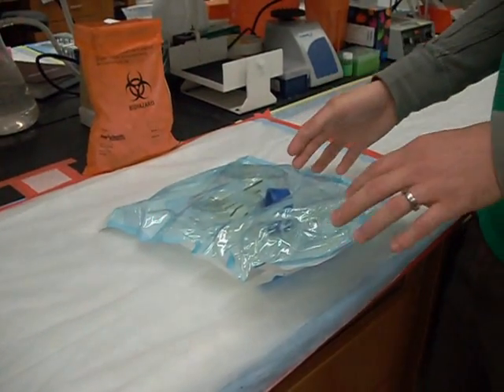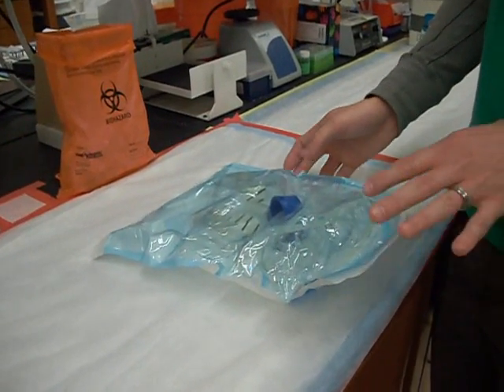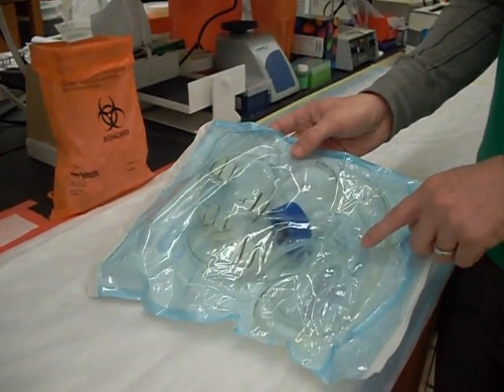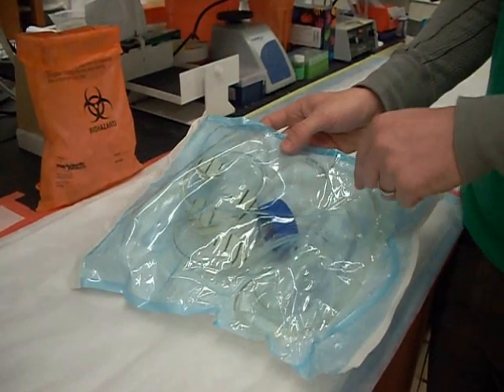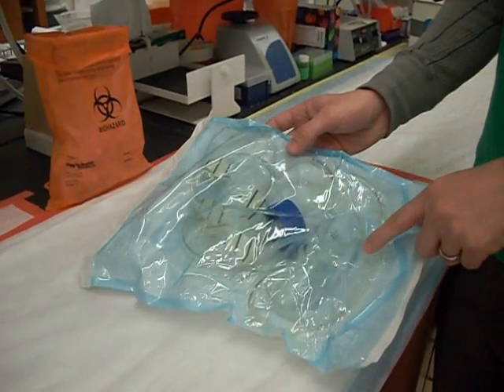One of the first things you need to have ready before you even start any flow experiment is you need to go ahead and have all your equipment sterilized. In this part we have the reservoir and tubing and some petri dishes autoclaved.